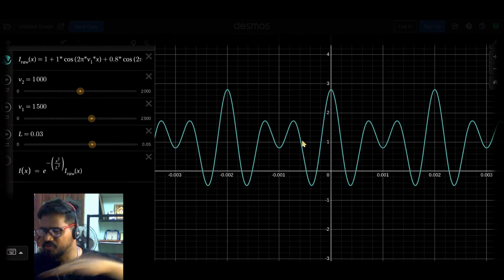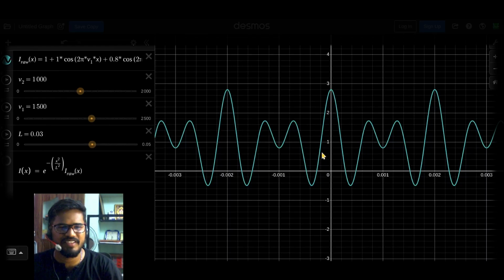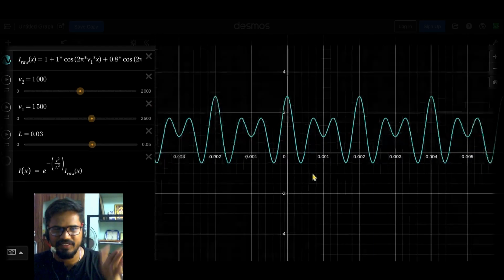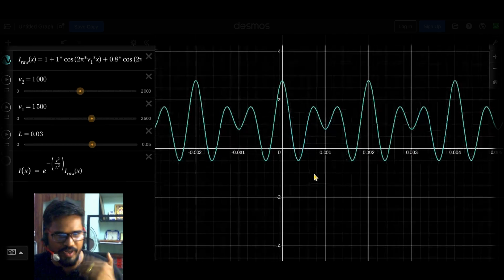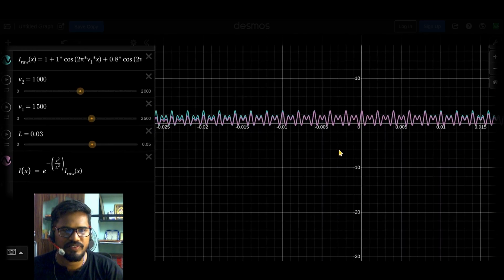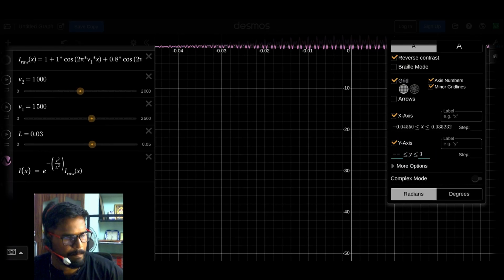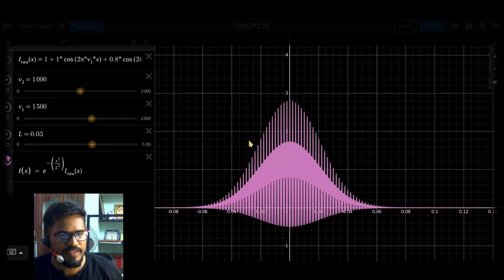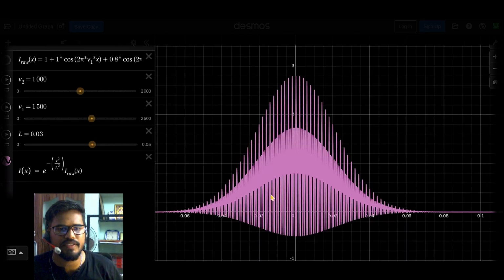And the signal is not infinitely long like this; it is kind of localized. You get a signal only at a specific duration. So your signal more or less looks like this. You are going to get a raw signal like this.